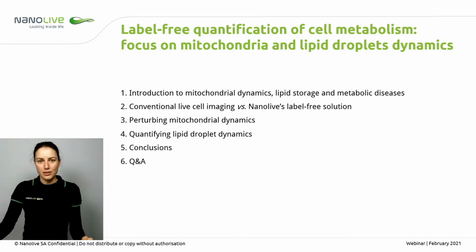Today's talk will be focused on quantifying dynamic changes in cell metabolism. I'll begin with a short introduction to the topic before introducing you to our technology. We'll then move on to the main part of the webinar, which will be split into two parts. The first part will feature the real-time response of mitochondria to respiratory inhibition, and the second part will focus on quantifying lipid droplet dynamics. As usual, I'll finish with some conclusions and discussion points before moving on to a short question and answer session.